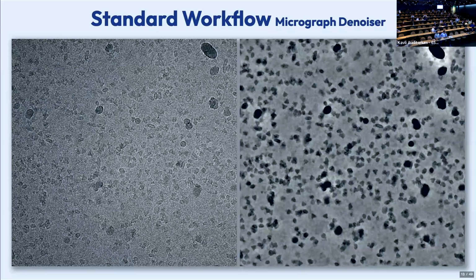And so across a range of defocus values, like this is just a single micrograph at a single defocus value, but you can imagine another micrograph from this data set that was collected at much more or much less defocus. It's actually going to visually look very different. And that often throws off particle picking as well. Denoising also takes care of that problem. So we'll talk about this a bit later today.